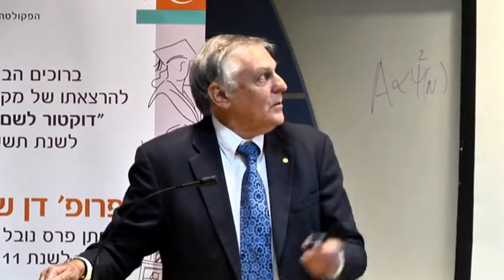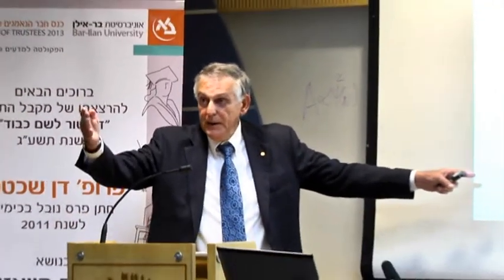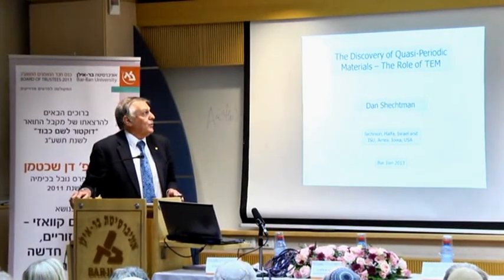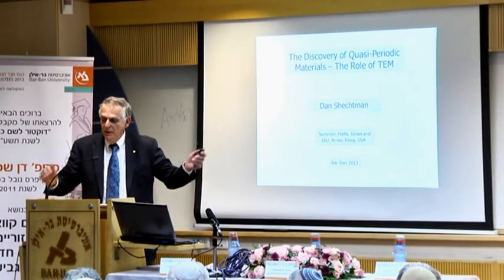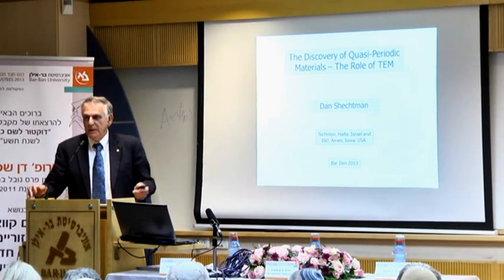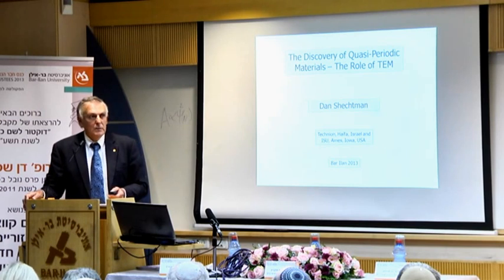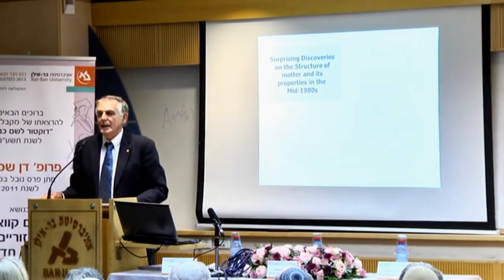Okay. So this is small, really. Can you see it from the back? Yes. Okay, fine. Good eyesight. So the talk is the discovery of quasi-periodic crystals, the role of TEM. TEM is the transmission electron microscope, and I will dwell on that a little bit. So in order to explain what happens in the discovery, let me take you back to the mid-80s.